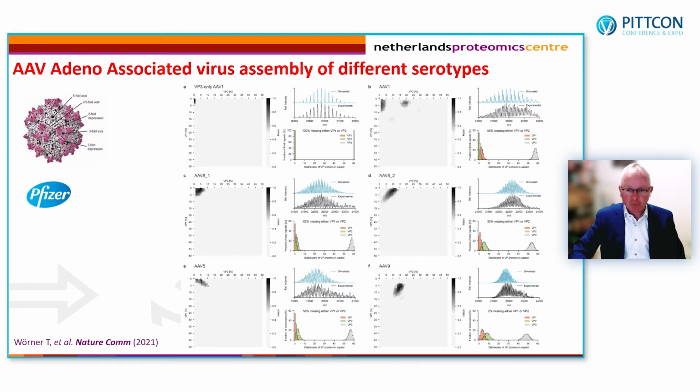Now, for the production process, these are very important parameters, and therefore we think that this unique way to measure these stoichiometries is of importance in the quality control of this sort of particles.